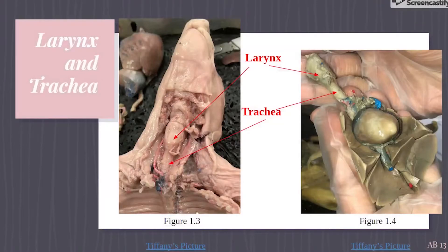Figure 1.3 looks at the placement of the larynx and trachea within the body, and Figure 1.4 looks at the organs when removed. After the oxygen passes through the nose or mouth past the epiglottis, it enters the larynx. The larynx, also known as the voice box, is a short section of the airway that connects to the trachea and contains vocal cords. During normal breathing, muscular tissue holds the vocal cords apart, allowing air to pass freely. After passing through the larynx, oxygen enters the trachea, also known as the windpipe. The rings of cartilage making up the trachea allow it to remain open to air at all times. The windpipe then connects to the bronchi, leading into the lungs.